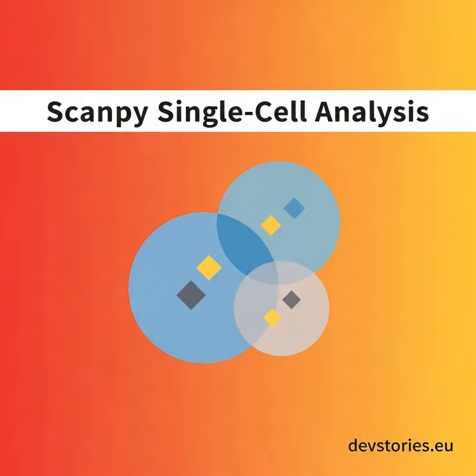Think of it like this: sifting through tens of thousands of genes to find the ones that drive differences between cell types means discarding the boring baseline housekeeping genes. A housekeeping gene is active in almost every cell at roughly the same level. Its expression is stable, which makes it useless for distinguishing a T cell from a B cell. We want genes that are heavily expressed in some cells and totally silent in others. These are the highly variable genes. Usually, you want to narrow your dataset down to about 2,000 of these key drivers.